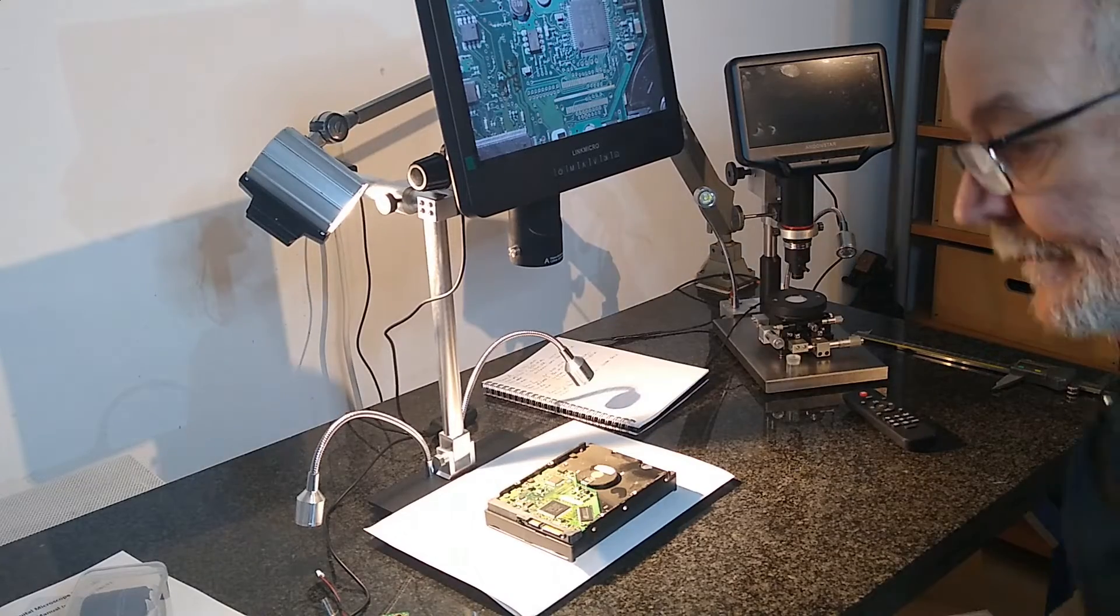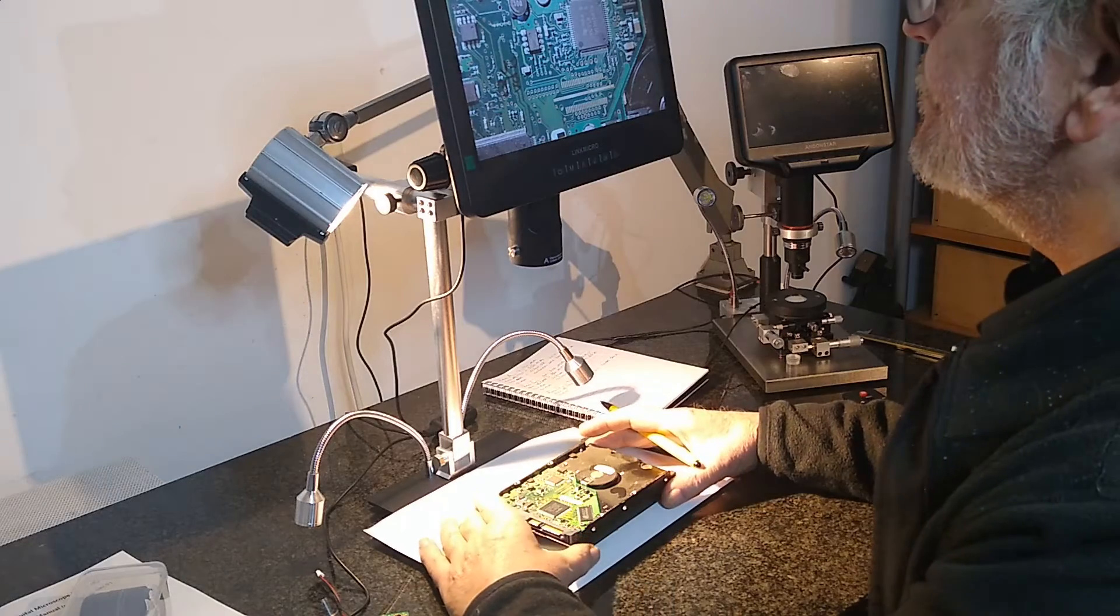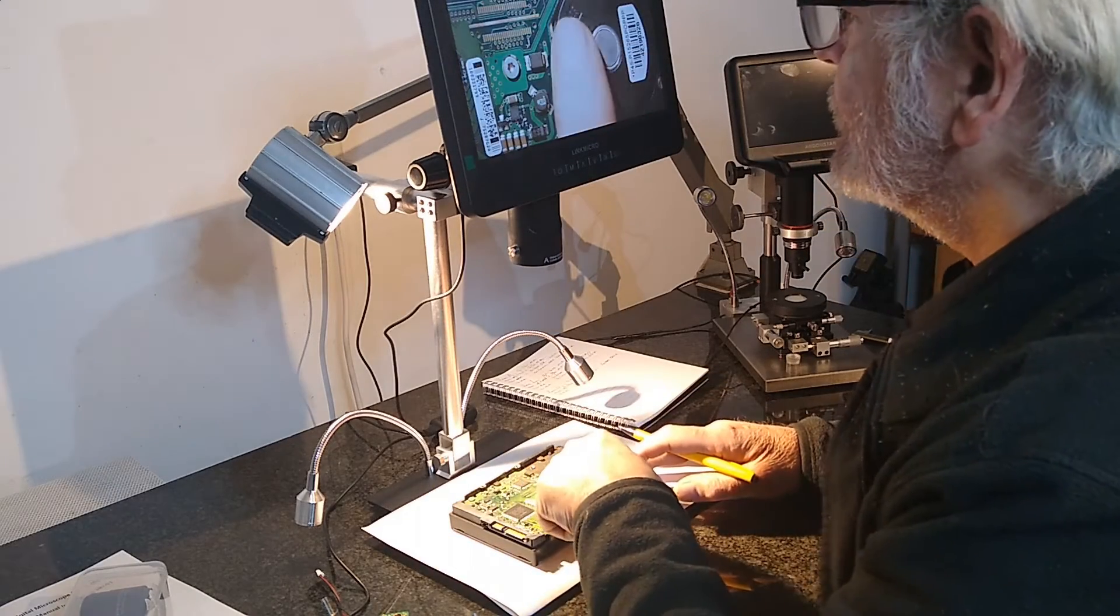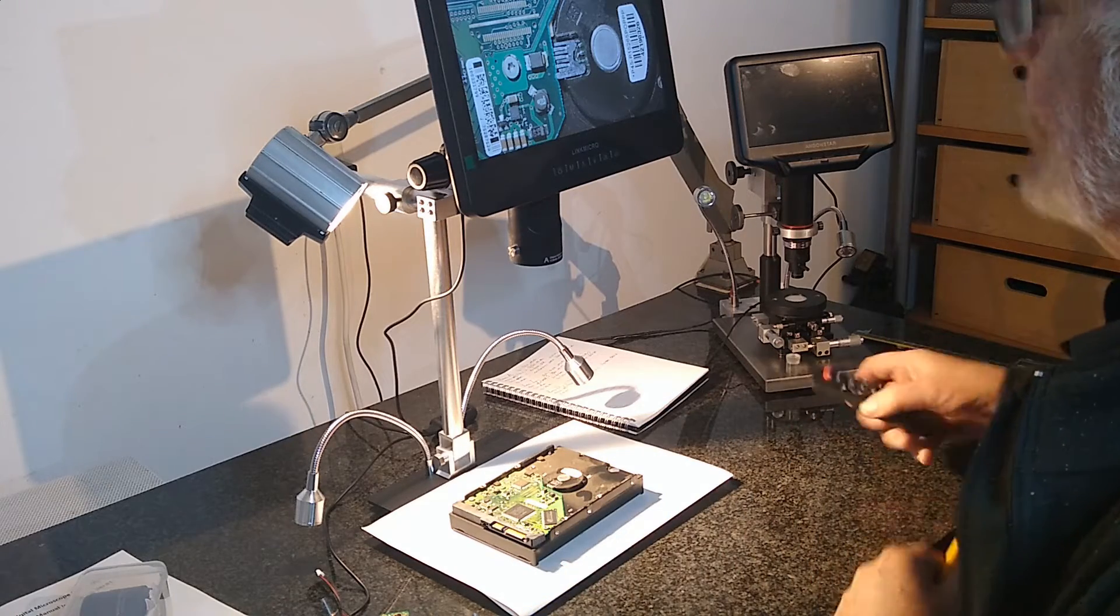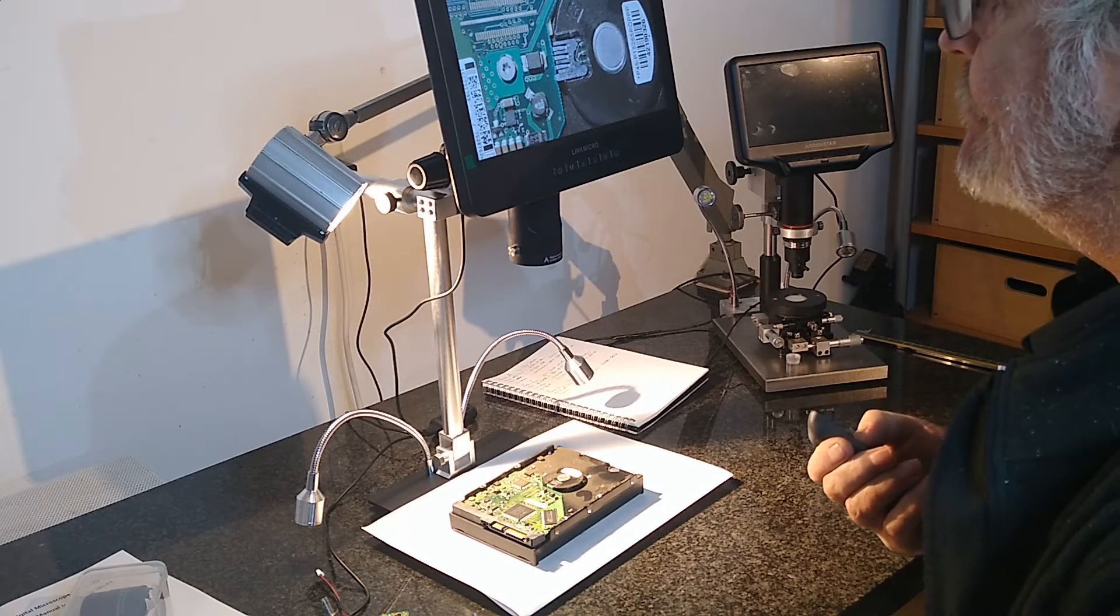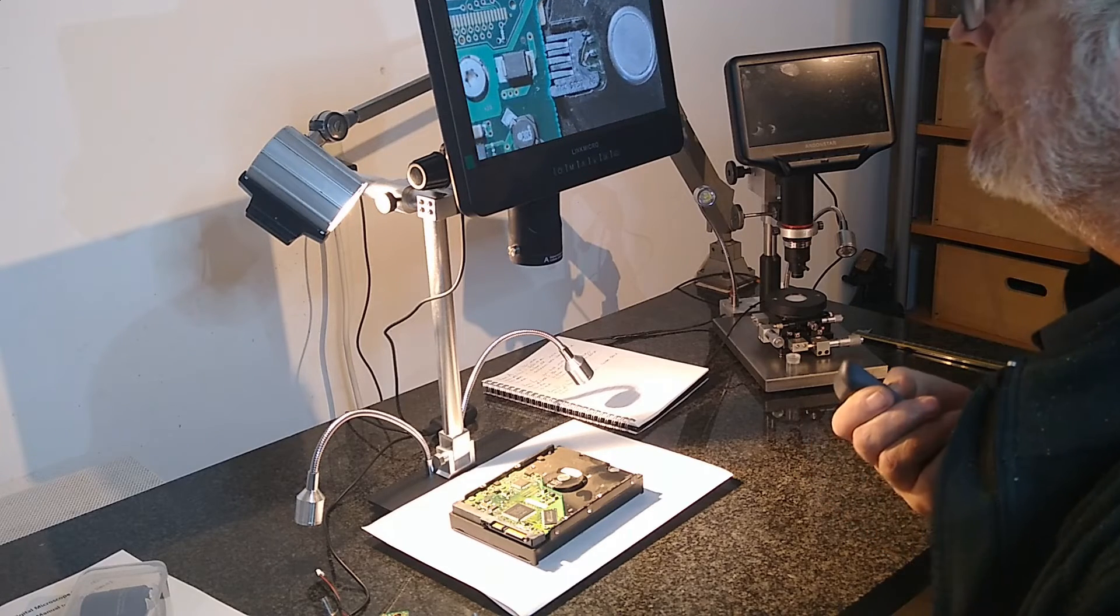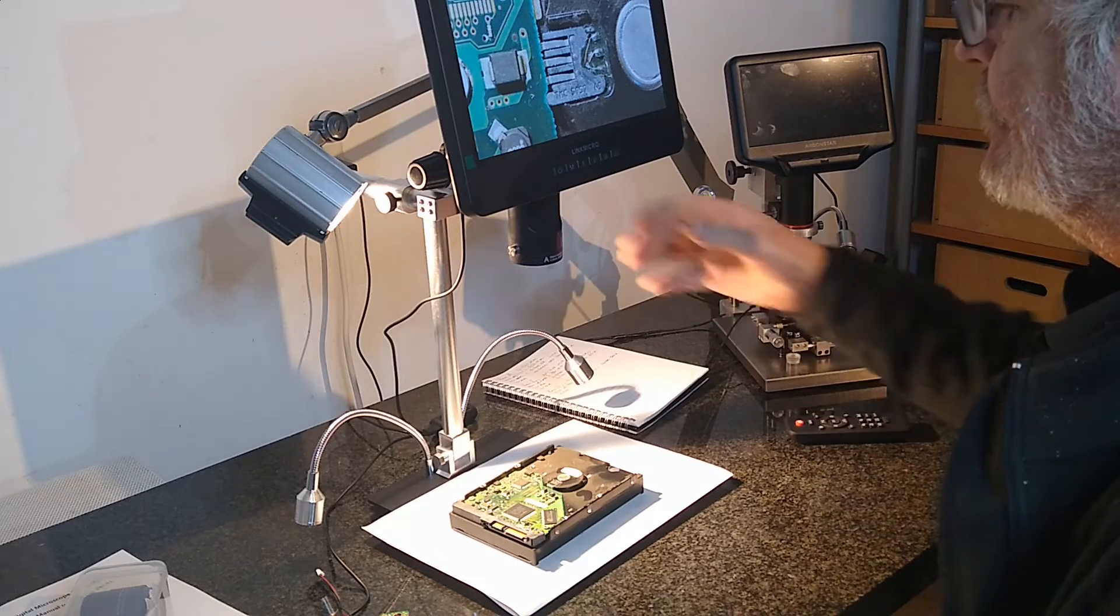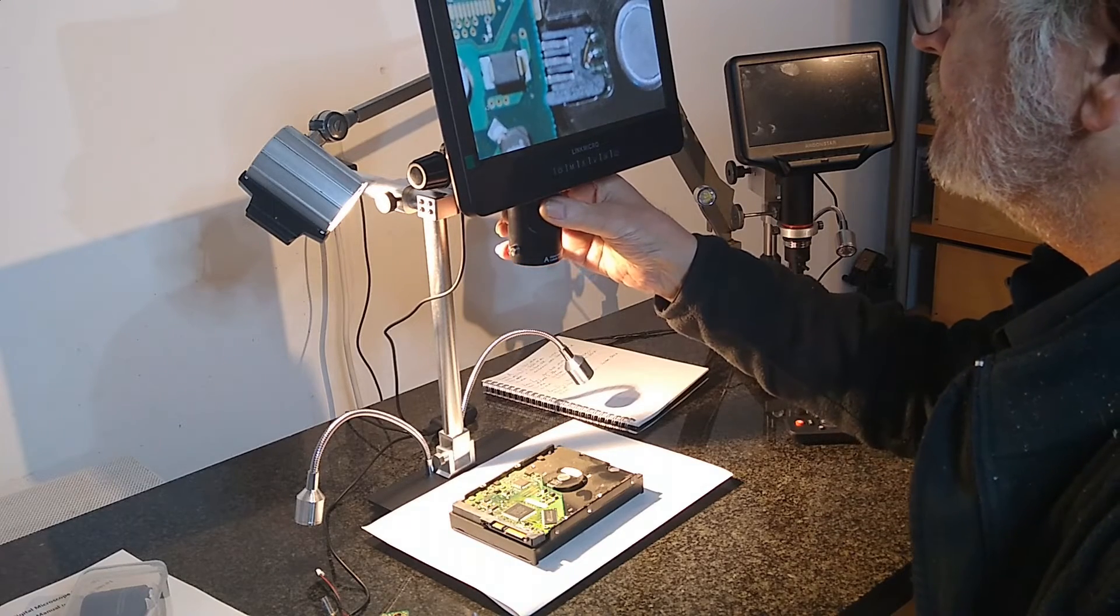The screen produces a beautifully crisp image without distortion or color aberrations. In this respect, there is little difference with the Andonstar AD407, which also gave such a beautiful image. But it also makes sense, because this microscope contains the same Novatec 96660 camera.